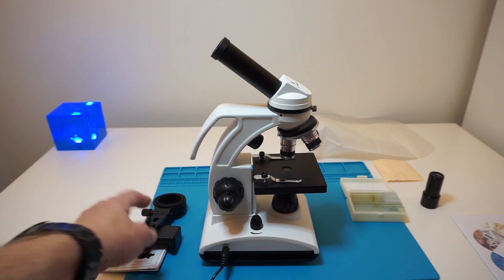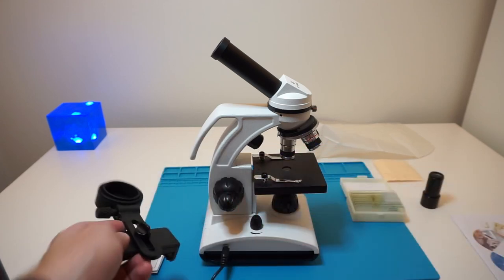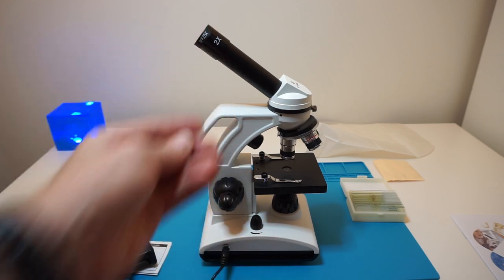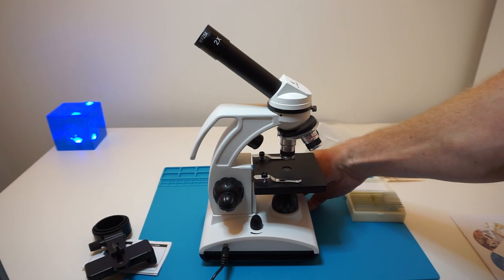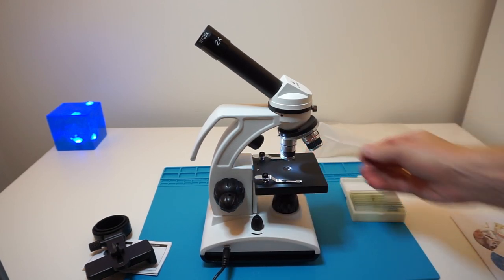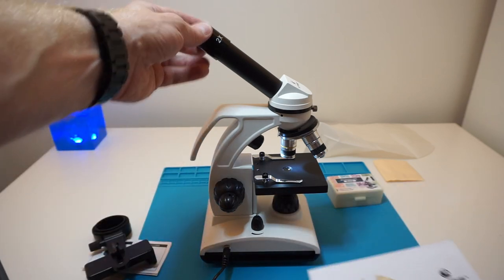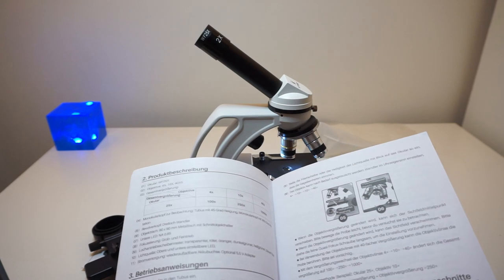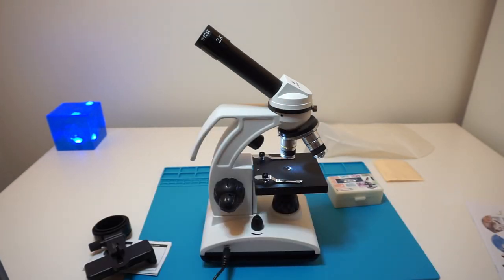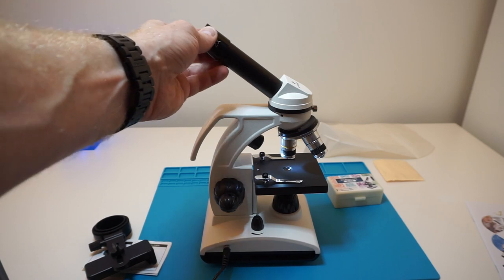Yeah, there is some utilities in order to make some pictures using your camera, so we're going to test that later on. Here is another device which then doubles the whole magnification level, and in the back you can see you can turn on the light. This is in transmission mode, and this is in direct light mode. As I said, the intent is to look at some CPUs. So what we will need to check now is whether there is enough magnification, whether there is extra enough light, and whether I can bring the whole things to focus. Let's have a try and see how this works.